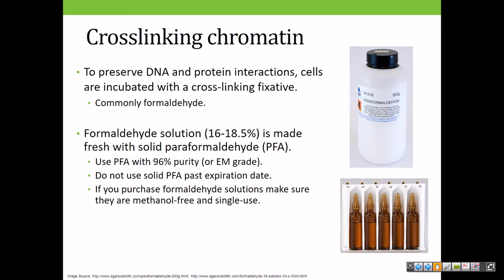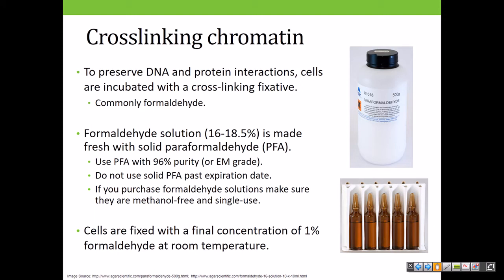Paraformaldehyde naturally doesn't have methanol. So when you make your solution with paraformaldehyde, it won't have methanol in it. Methanol can definitely significantly affect the conditions of fixation because it's completely different from the fixation of formaldehyde. It basically crowds out the water, forcing proteins to aggregate. You don't want that to happen. Okay, so in most protocols I've seen, cells are fixed in a final concentration of 1% formaldehyde at room temperature. Sometimes with agitation, sometimes without, but normally 1% formaldehyde.